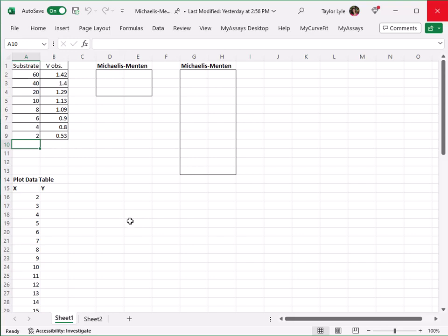I have opened an Excel spreadsheet with my substrate values and my observed velocity values. The substrate will constitute the X values, and the velocity will constitute the Y values.